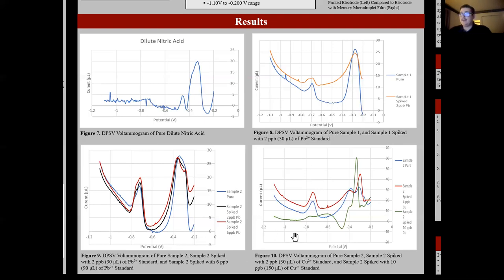And in figure 10, you can see sample two again, but this time spiked with copper, two parts per billion at first, and then 10 parts per billion worth of copper standard. You can see this peak growing and shifting slightly, but rest assured it is still copper.